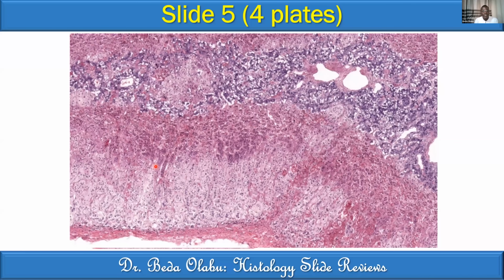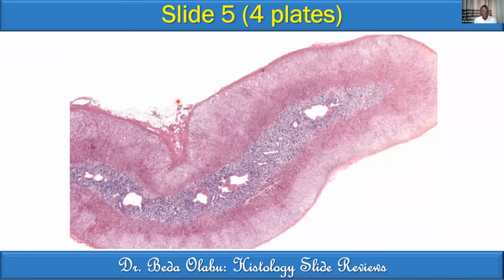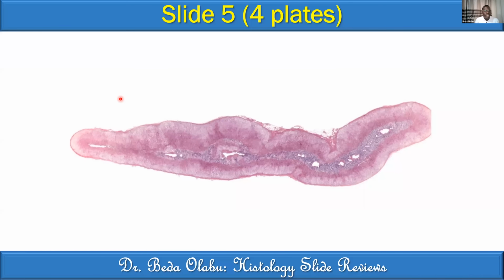All right, good. So yes, this is the slide of the adrenal gland. And when you're given a slide of adrenal gland like this one, it's okay to even just start with the shape of what you're seeing. Now that you're able to see the whole organ in totality, you can talk about the overall shape. Perhaps tongue-like.